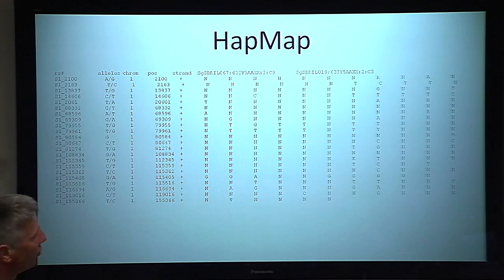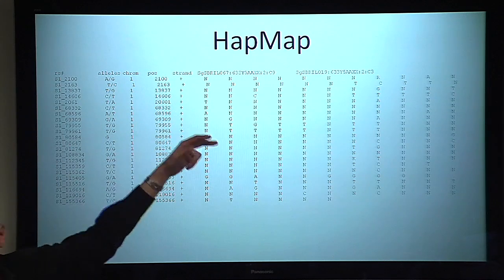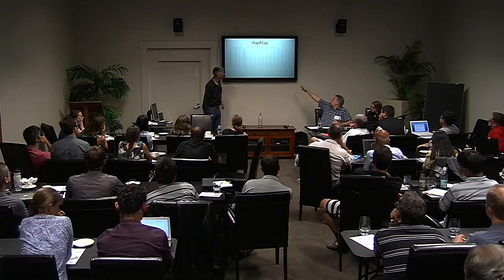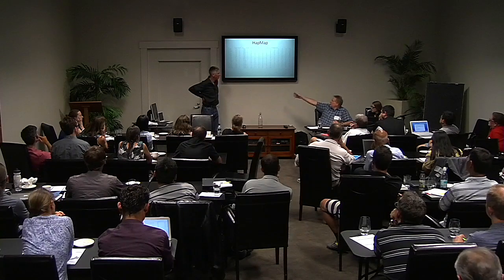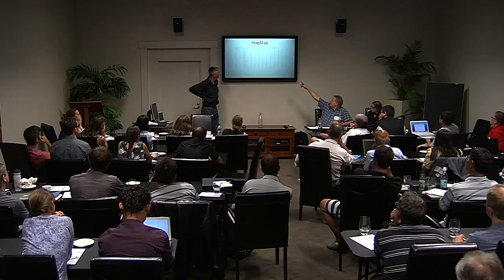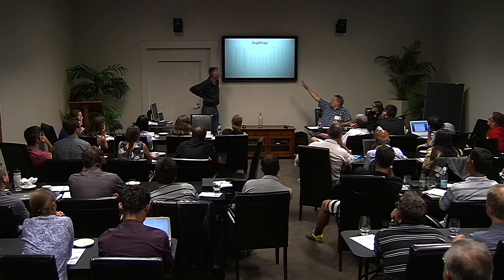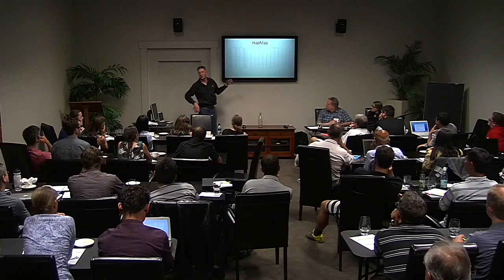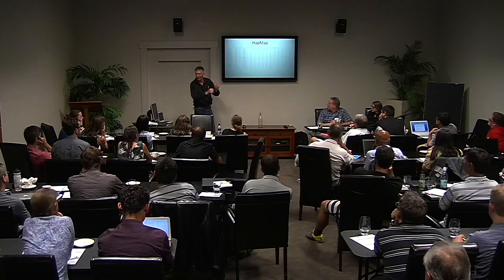Now this table goes really far out, so you don't see necessarily all of this stuff here. But what you do see, each of these columns is a taxon or sample's genotype, and there's only two names shown here, but there's actually as many names in the file as there are columns of genotypes. But this is one of those deals when you're working with a text file and things get a little bit skewed.